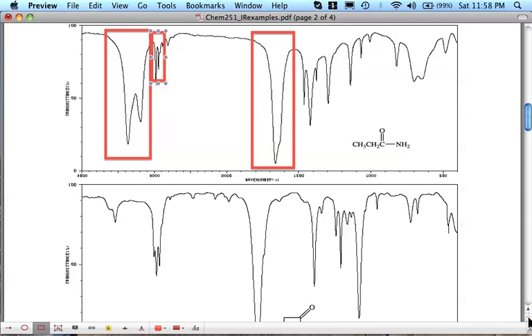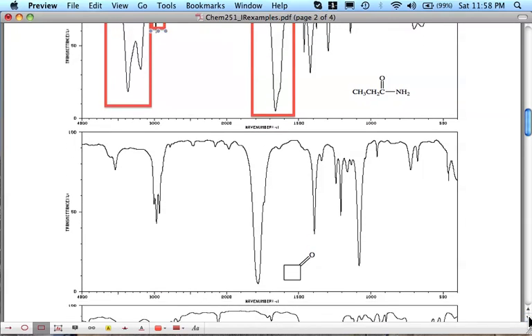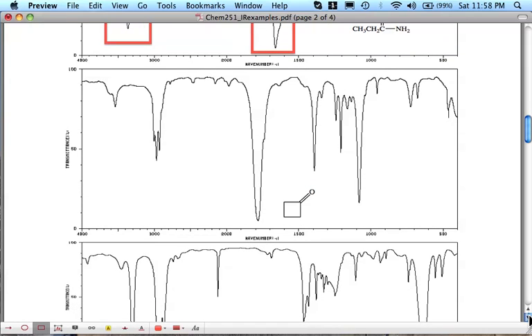Finally, I think the last carbonyl compound that I have to show you in this set of examples is a cyclobutanone. And remember, we just mentioned those briefly when I was looking at the handout. When you put a carbonyl in a ring, and it wouldn't have to be a ketone, you could have an oxygen here, so it would be a cyclic ester, and we'll be talking about those sorts of functional groups later this semester in class, when you put them in a smaller ring, it causes the shift of the stretch to come to higher frequencies.